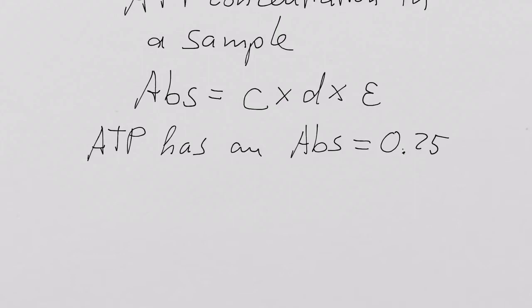What's the unit for absorbance? There is no unit exactly. So we have an absorbance of 0.25. Is that good or bad? It's bad. Why? Because it's much less than 1. Aha, it's much less than 1. I told you last on Monday that 1 is sort of a critical limit with absorbance. Actually, what I meant to say, probably didn't make it very clear, anything above 1 is bad. But we are below 1, so absorbance of 0.25, okay. Can deal with that. The spec can't deal with anything that's higher than 1. Lower than 1, not a problem. So 0.25 is okay.